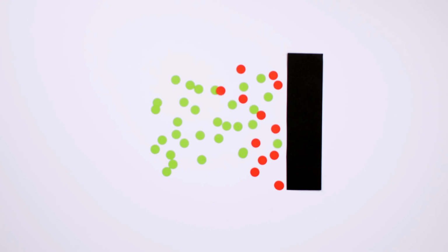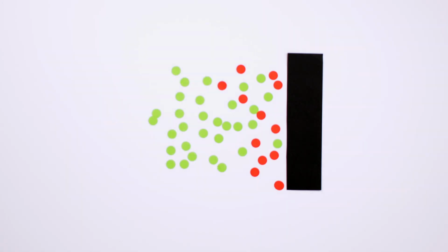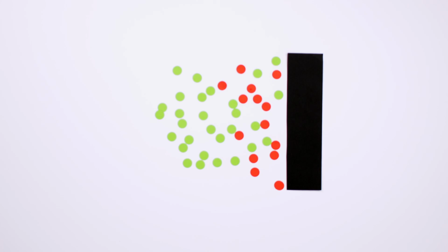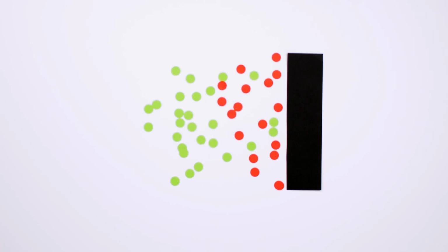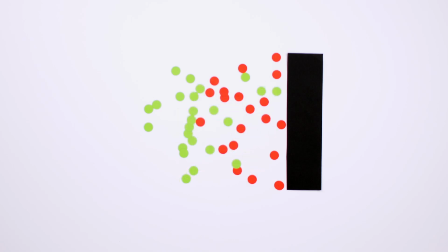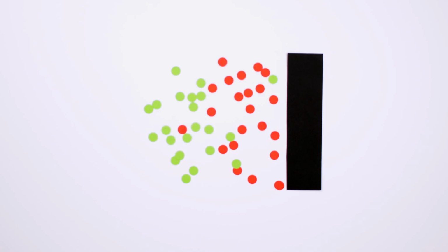The transport, if we're not stirring our liquid, happens by diffusion. This is the random jiggling of molecules in the solution. Diffusion is relatively slow on large distances, meaning that it takes time to replace the molecules at the electrode surface. Another way to put it is that as the depletion layer grows thicker, the gradient of concentration becomes smaller. According to Fick's first law, the flux of molecules is proportional to the gradient. We now understand that the concentration in the Butler-Volmer equation is the concentration at the electrode surface.